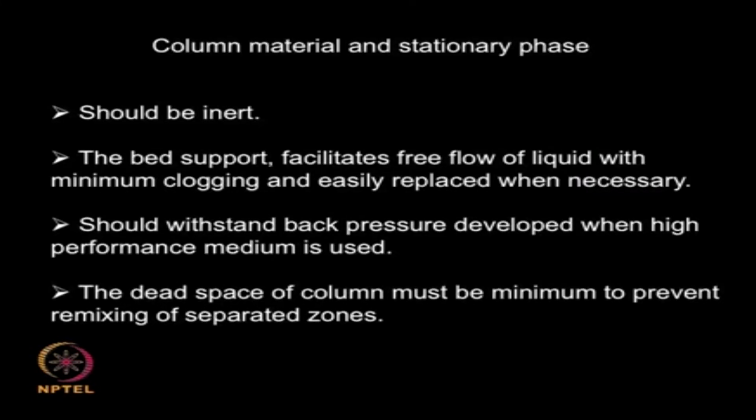What are the column material or the stationary phase we need to consider? The column material should be inert, and the bed support should facilitate free flow of liquid with minimum clogging. That is very important. If you are going to have clogging, you are going to create pressure inside the column and a back pressure. So the pump which is pumping the solution inside is going to have problems, and the column material should be easily replaceable, so that we can charge with fresh material inside.